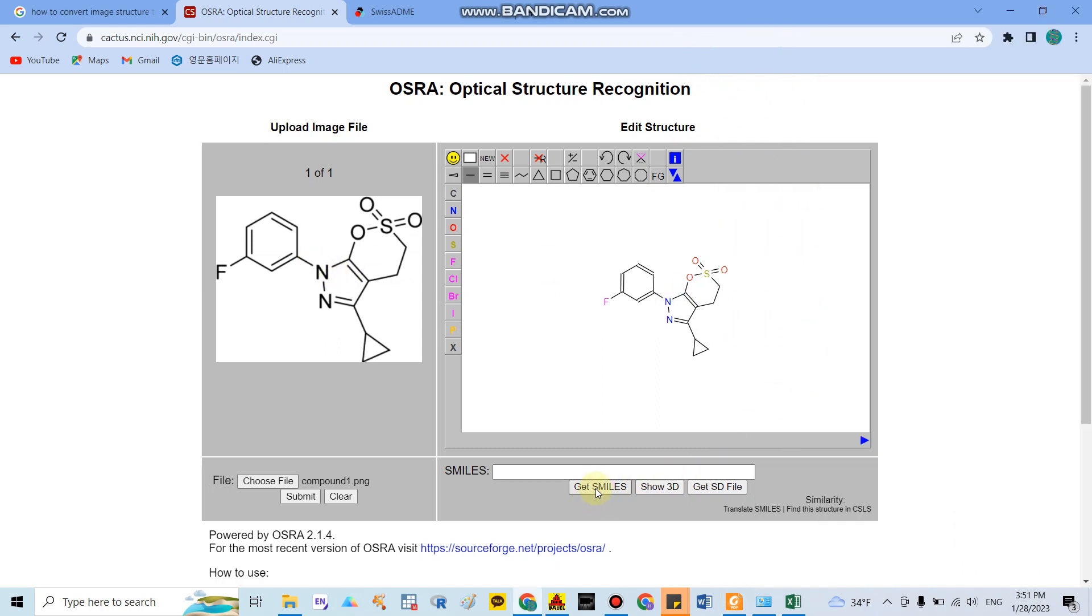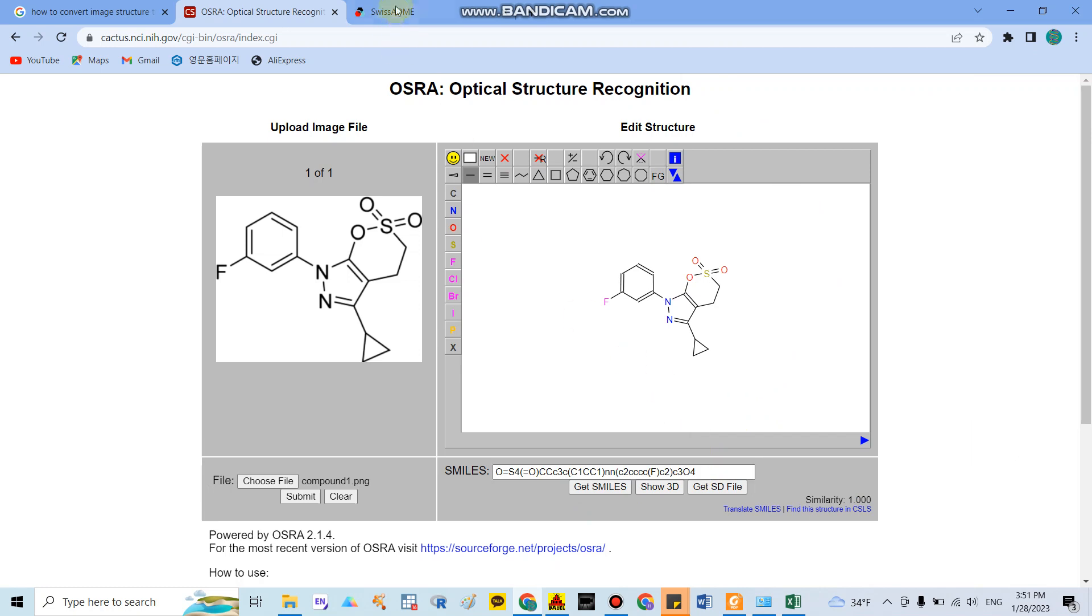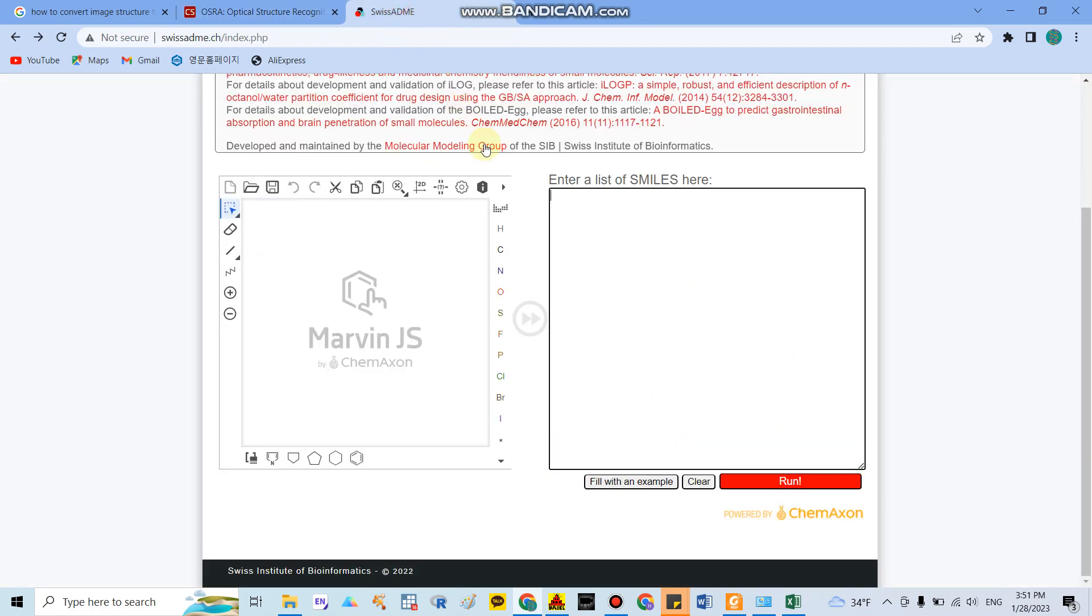After that you only click get SMILES and you can copy the SMILES here. Then you can go to SwissADME.